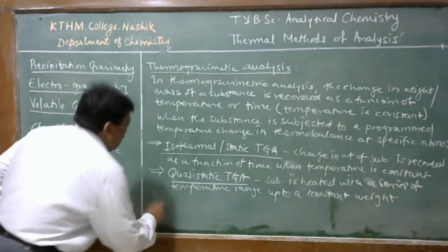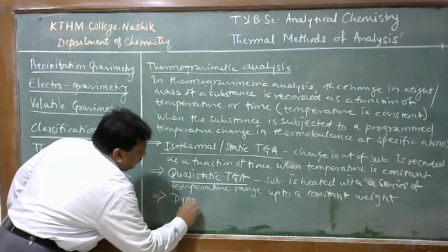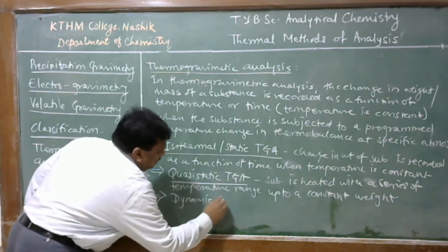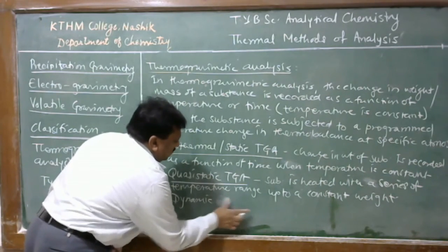Third type is called dynamic thermogravimetric analysis.